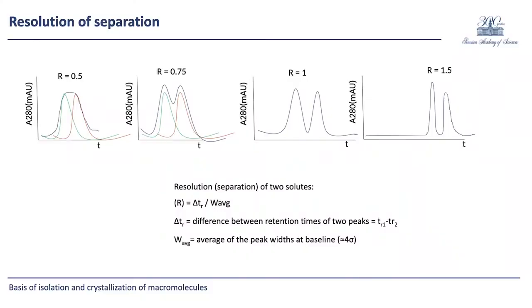Analytical chromatography is used for the analysis of mixtures of substances or the development of purification schemes. Preparative chromatography is used to isolate pure components in large quantities by using the selected technology. What else should I mention talking about chromatography? It is resolution. On the previous slide, you saw well-resolved peaks.